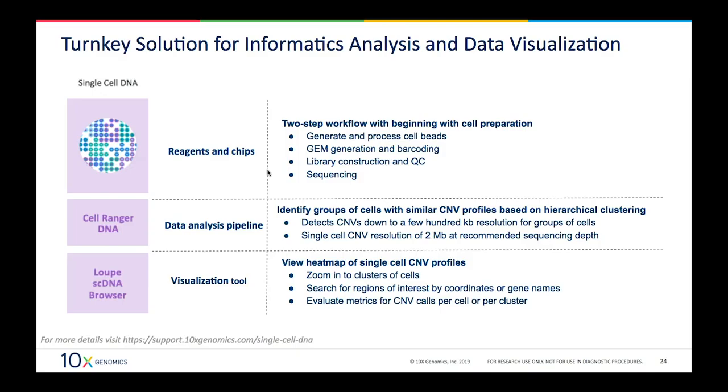And we will touch upon the visualization tool that 10x provides for you, that allows you to zoom into clusters of cells and search for regions of interest. So it's a nice genome viewer where you can survey your population of cells.